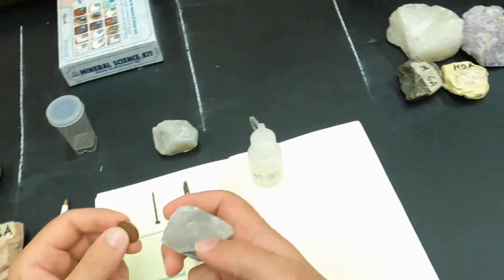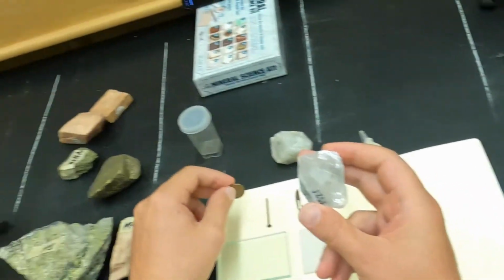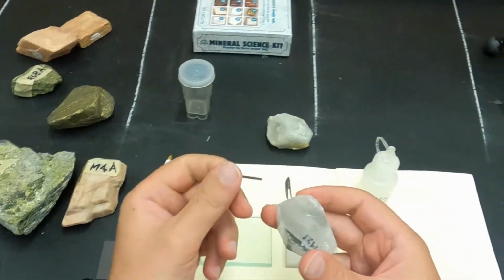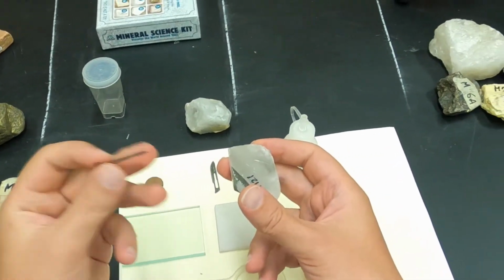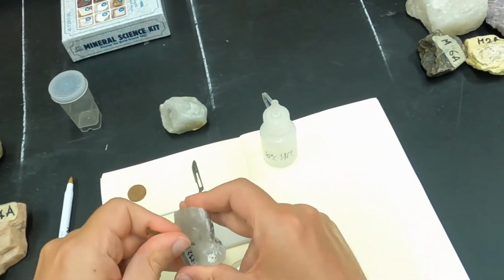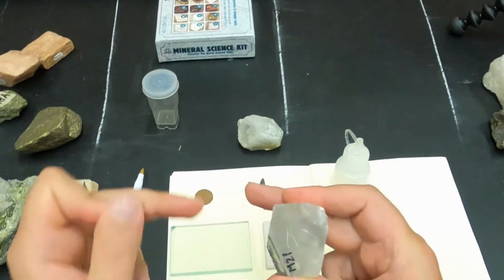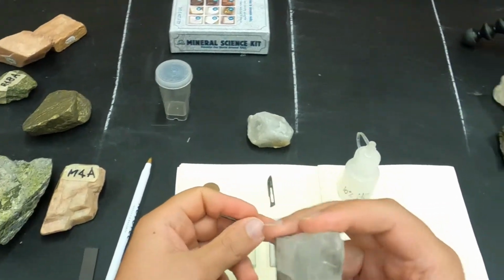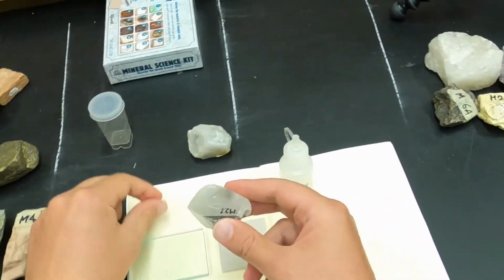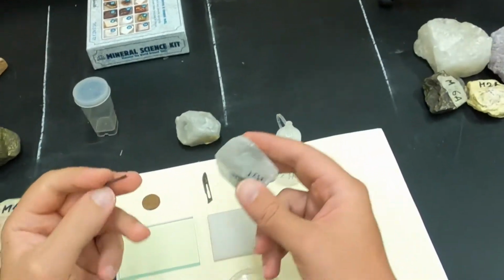So why is that? Well, that's because the hardness of this mineral is either harder or the same. Do you think that this is harder? Well, we don't know until we test it. If we use a pin nail, which is on the order of 4, and I'm able to scratch the mineral, and you can see here clearly some scratches, I would automatically know that this mineral has a hardness less than 4 and probably on the order of 3. So this is how you test for hardness.